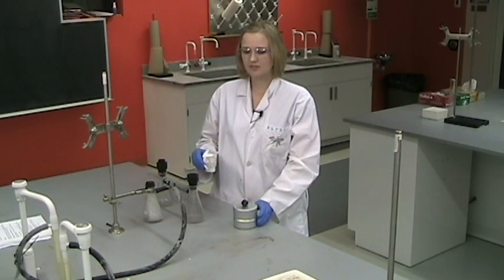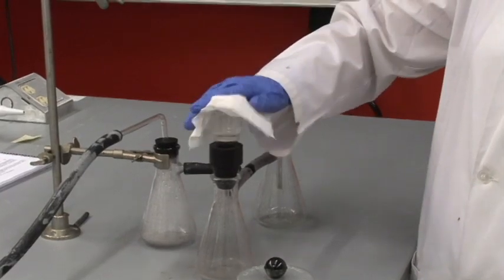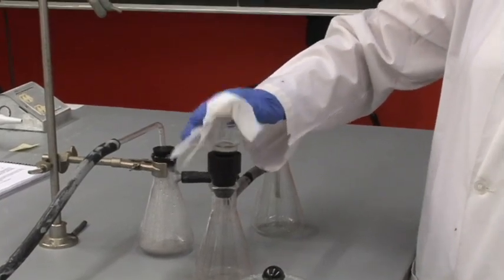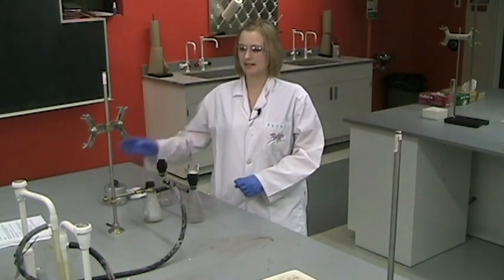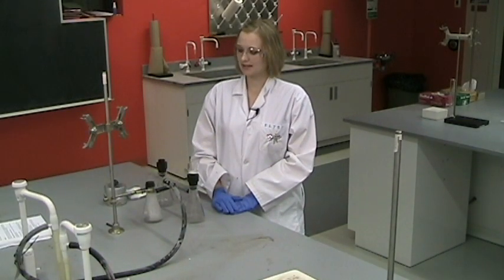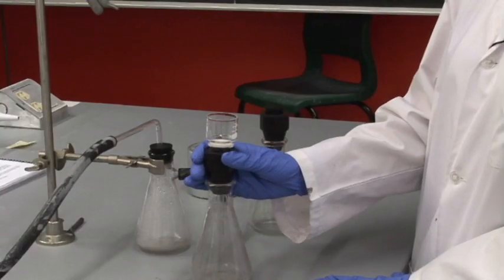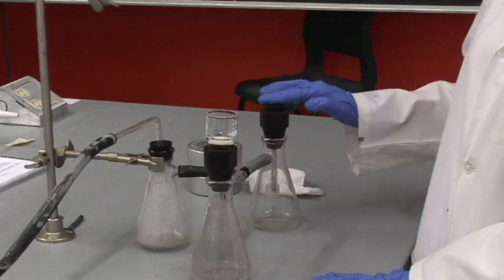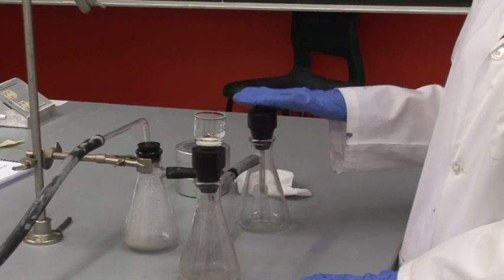When you are ready to start filtering, when you've taken the mass, you'll set the crucible onto the filtration apparatus and ask your TA for help in getting this set up and in how to use it. In this case, I'm demonstrating how to filter one sample, so I've plugged the other side, but normally you just would put the second crucible on this side here.